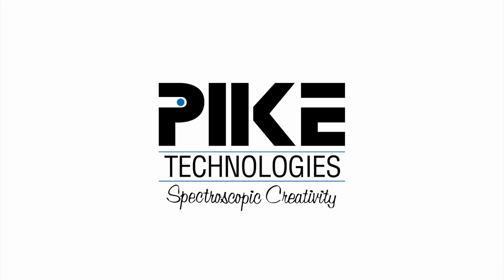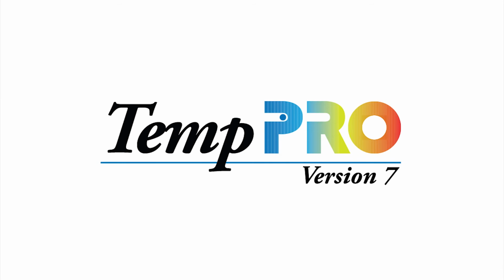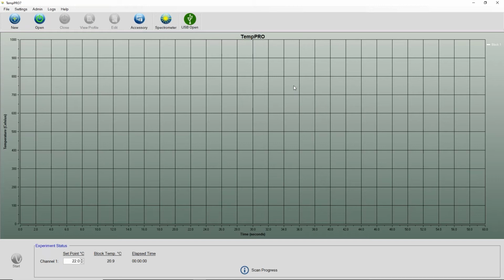Welcome to Pike's TempPRO software tutorial. This video is intended to be a quick start guide. I'll introduce you to new features found in TempPRO and show you how to set up a profile.